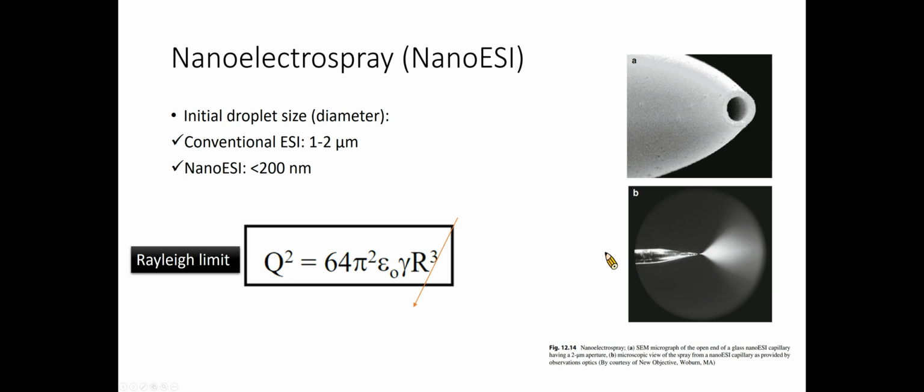Miniaturization of electrospray, or nano electrospray, is even more attractive than access to high liquid flows for better ionization efficiency. The tip has a narrow bore of 1 to 4 micrometers in diameter, making flow rates of 20 to 50 nanoliters per minute sufficient to provide a stable electrospray.